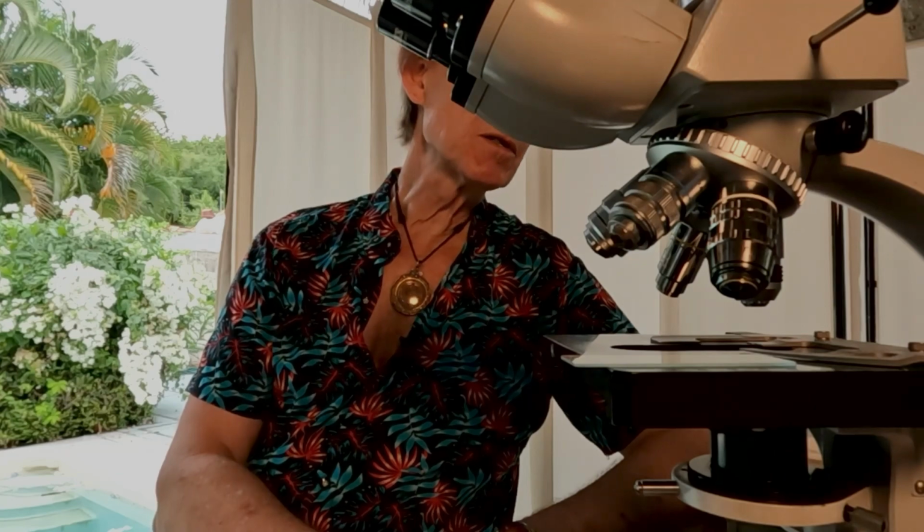The removal of that static electricity ensures that we don't have that static electricity altering the structure or function of those cells on the slide, and it will do that significantly. All of what I'm talking about now in regards to artifacts has been thoroughly researched over the years with probably 1,000 hours of research on how not to have artifacts on the sample.